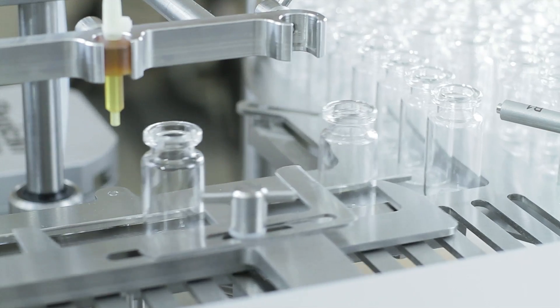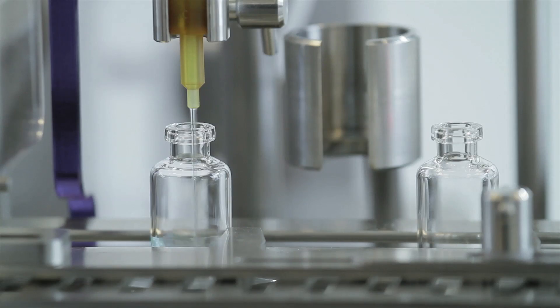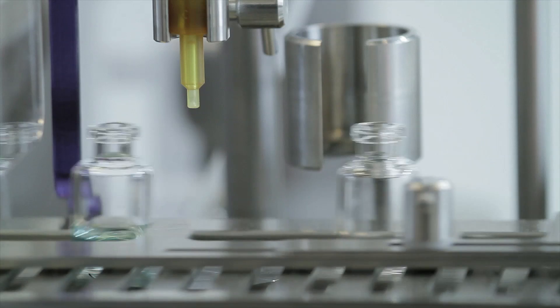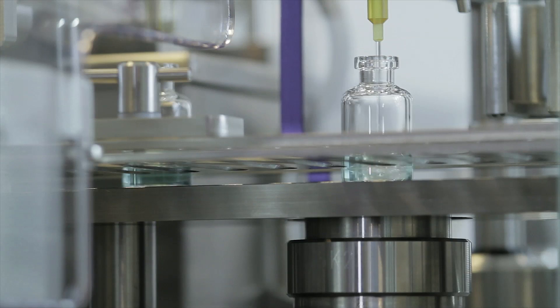It is a ready-to-use and easy-to-validate filling system for small batch production where it can achieve filling accuracies of plus or minus half a percent.